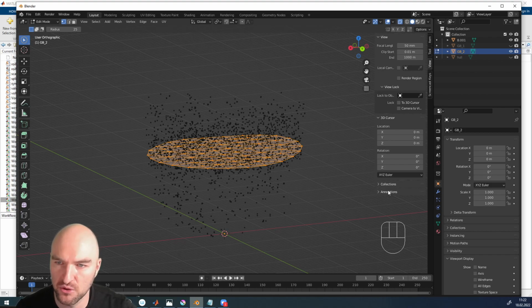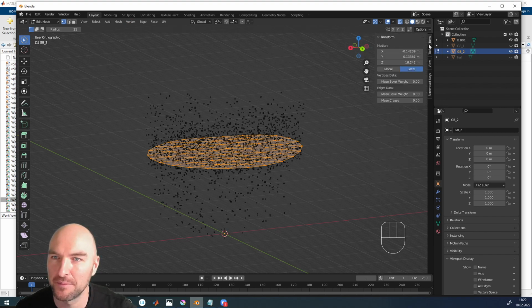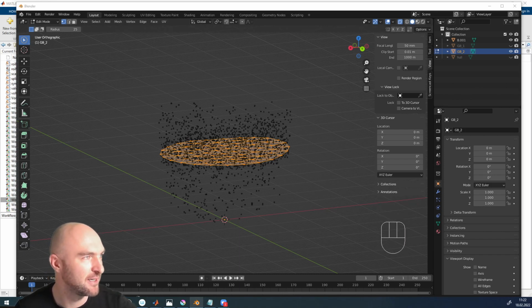For now, actually, you could use the old one as well. Bloody hell! I should really spend more time with the new version of Blender. So where do we have these surface normals? Is there a new annotation? No, there's not a new annotation. Let me look that up.